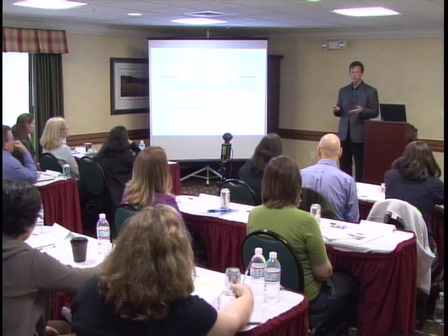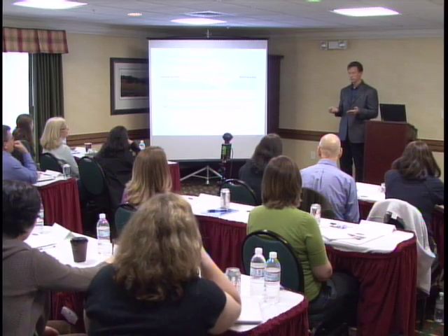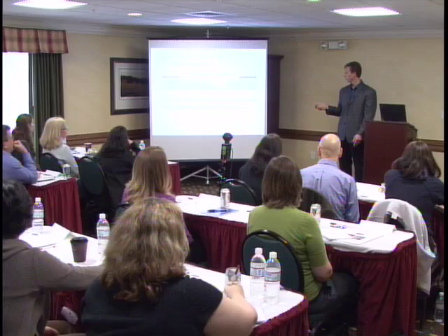We get a very precise measurement. We measure an intrinsic property of the amplicon that tells us the base composition, the base composition that's expected for, say, allele 13 of this locus. We can compare our result to that directly. We don't have to run a standard next to it. And then we do a little bit of multiplexing with this.